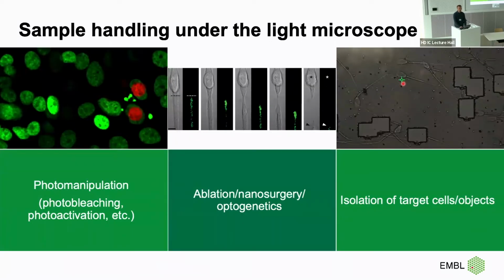Let's now switch from the imaging examples to another type of application, which we have to do a lot, where we need to do something with our sample on top of just imaging it, right?